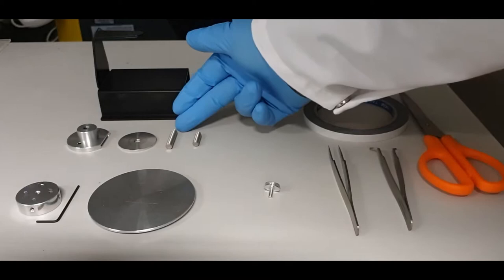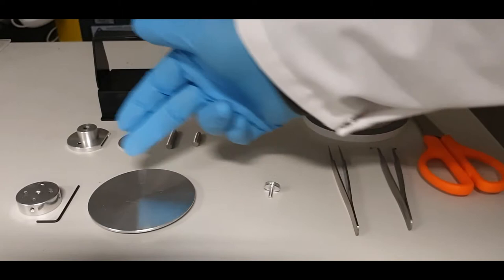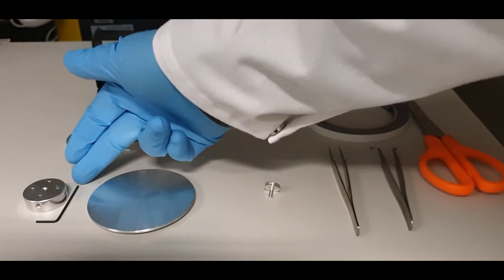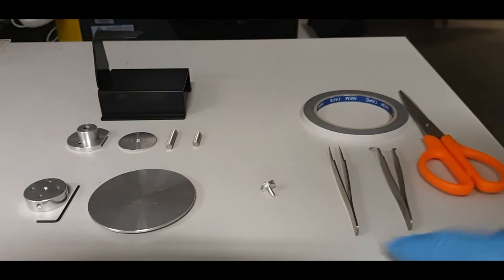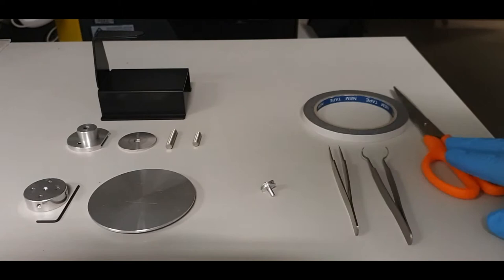You will then need a suitable sample stage — either this flat plate or a pin stub mount. If you're using the pin stub mount, you'll also need this allen key. You'll of course need your samples, preferably mounted on pin stubs as this makes sample mounting much easier. You might also need tweezers, stub tweezers, carbon tape, and scissors.